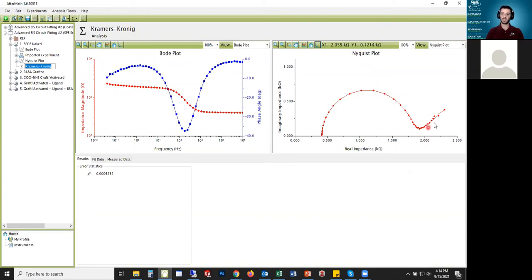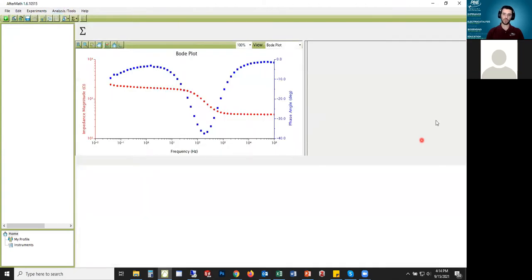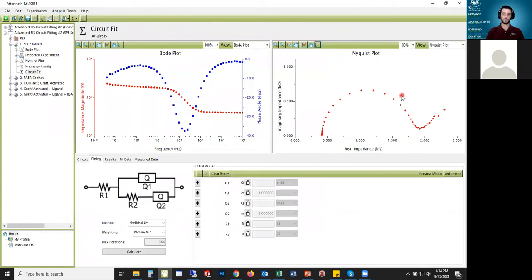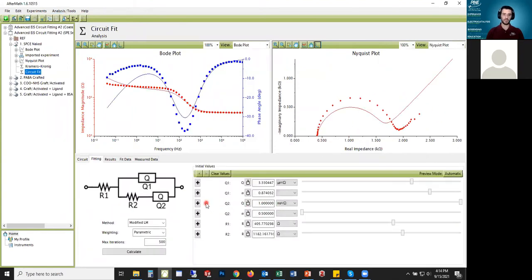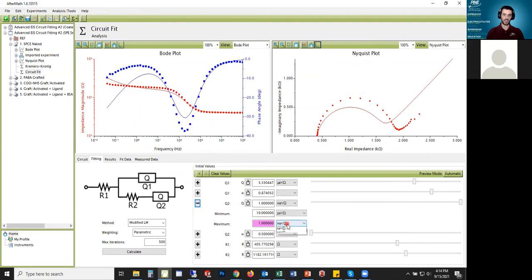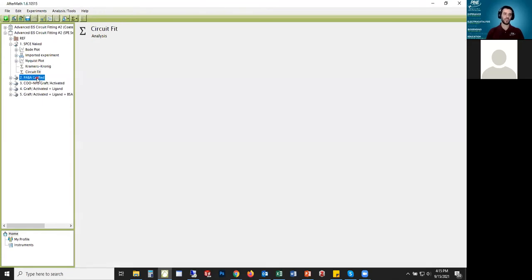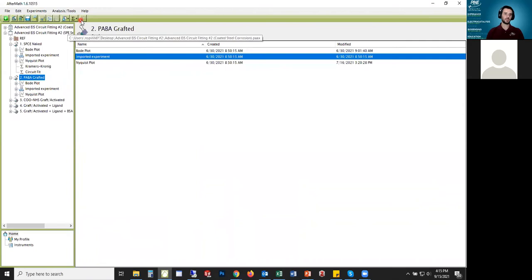The first naked SPE data, you see pretty standard kind of semicircle with a little bit of a diffusional tail, a little bit of drift going on for sure, probably just from some diffusion, some normal kinds of drift perhaps at low frequency. This fit is pretty standard. I can just increase this CPE and I get a decent fit. I could probably iterate this more and get a little bit of a better fit, maybe two Randalls elements, but for these purposes now this is adequate.